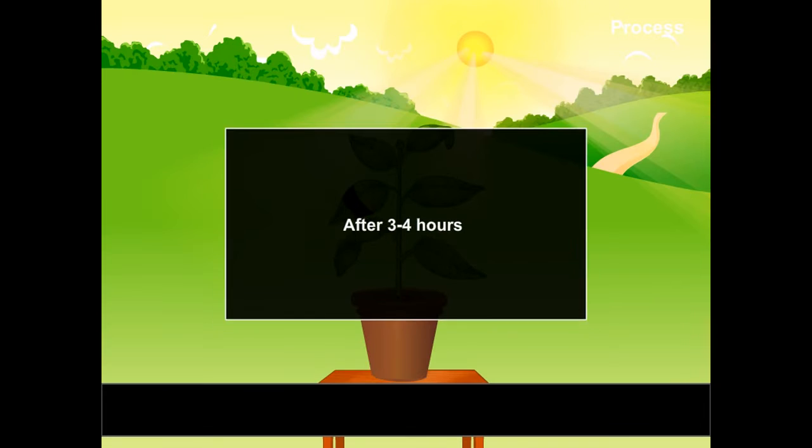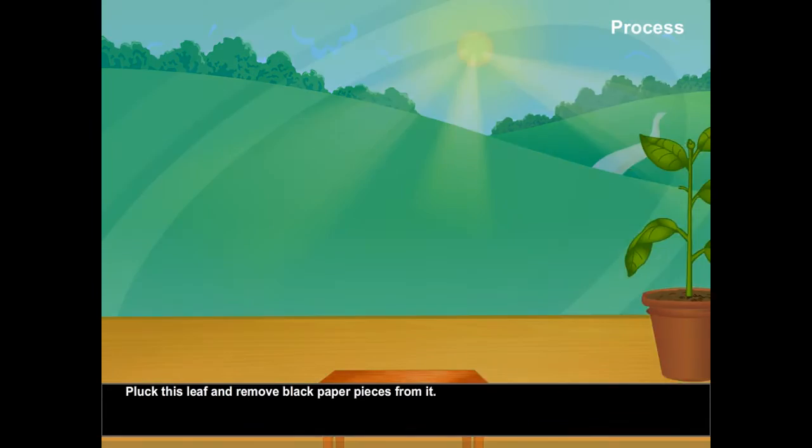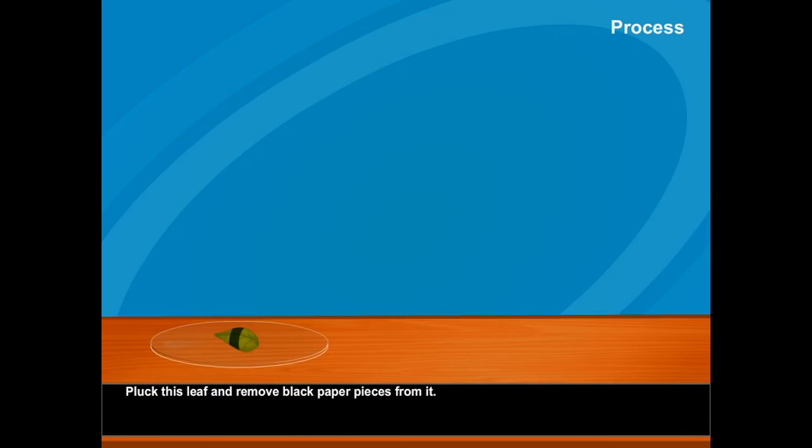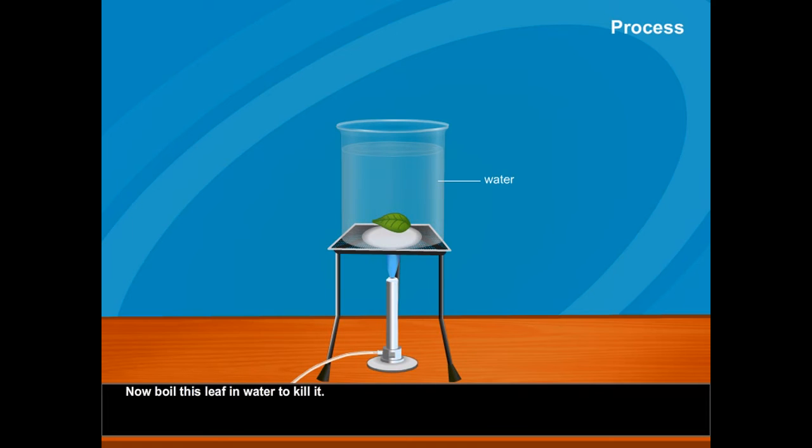After three to four hours, pluck this leaf and remove black paper pieces from it. Now boil this leaf in water to kill it.